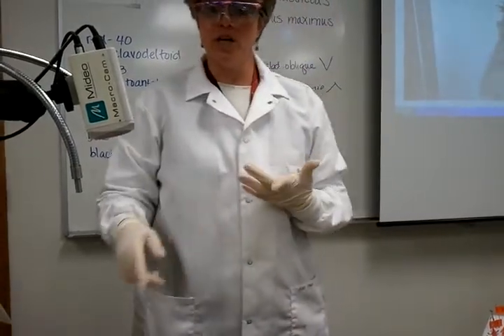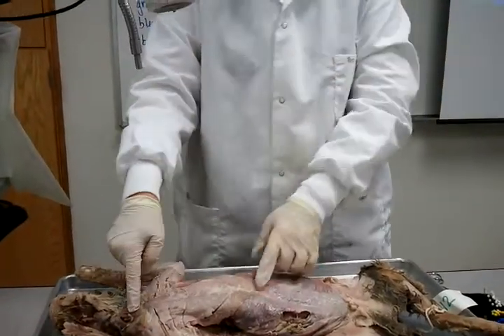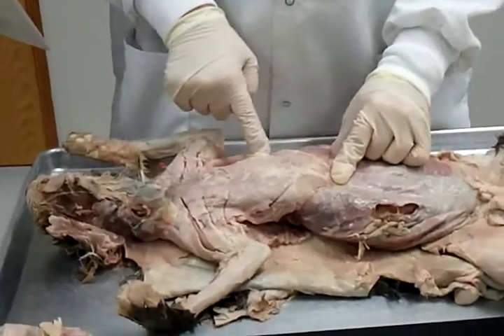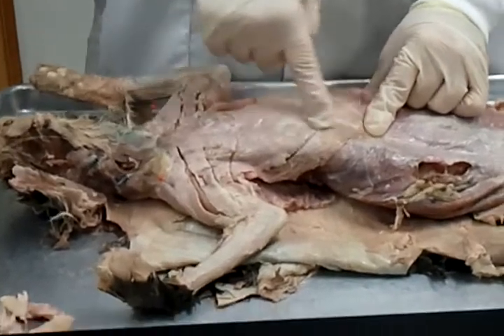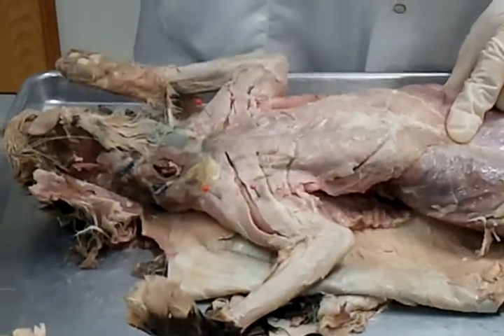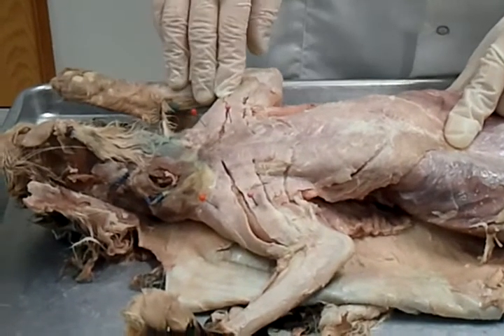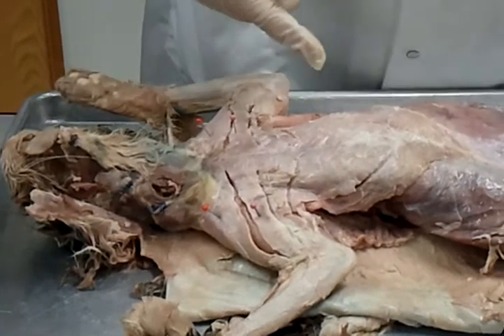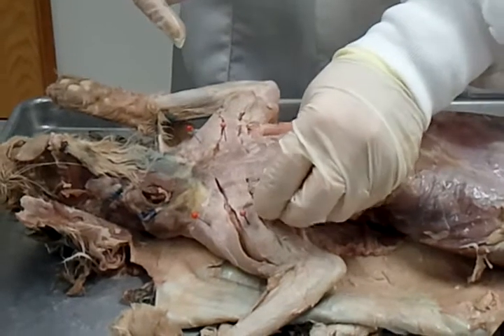Okay? So we're going to learn about all those muscles attached to the sternum, and the cat's sternum goes all the way down to here. See these V-like structures? All of this is attached to the sternum in here. Okay? So what I'm going to do is walk you through in layers, because these muscles are layered on top of each other, all the way up and down.